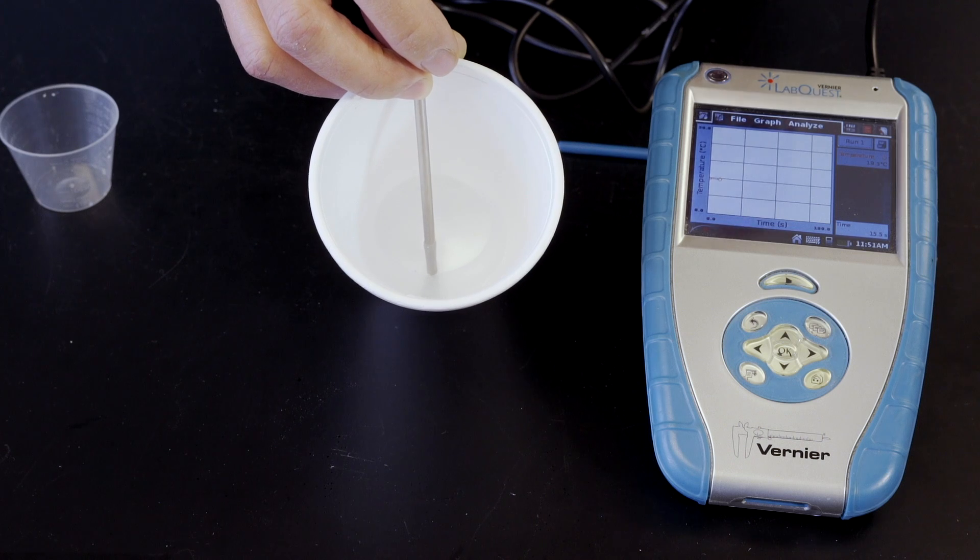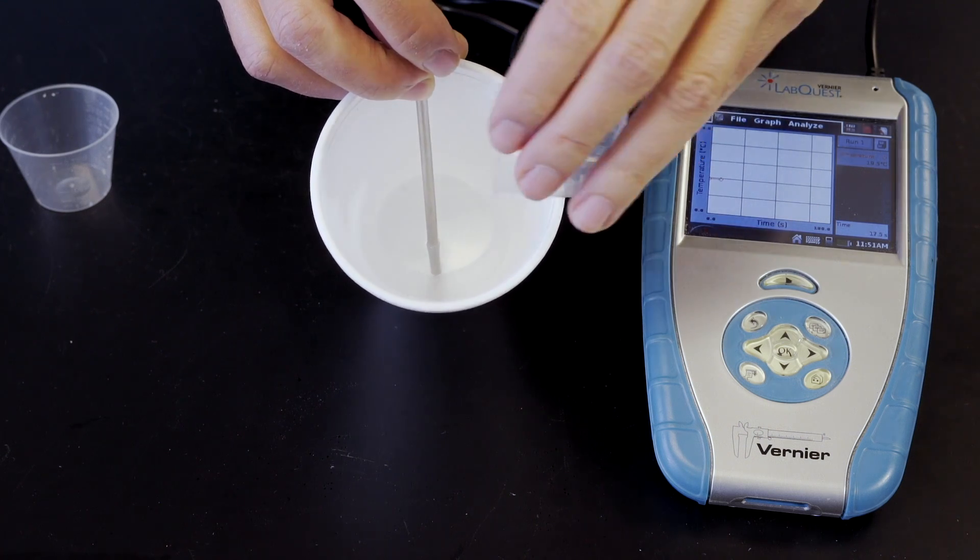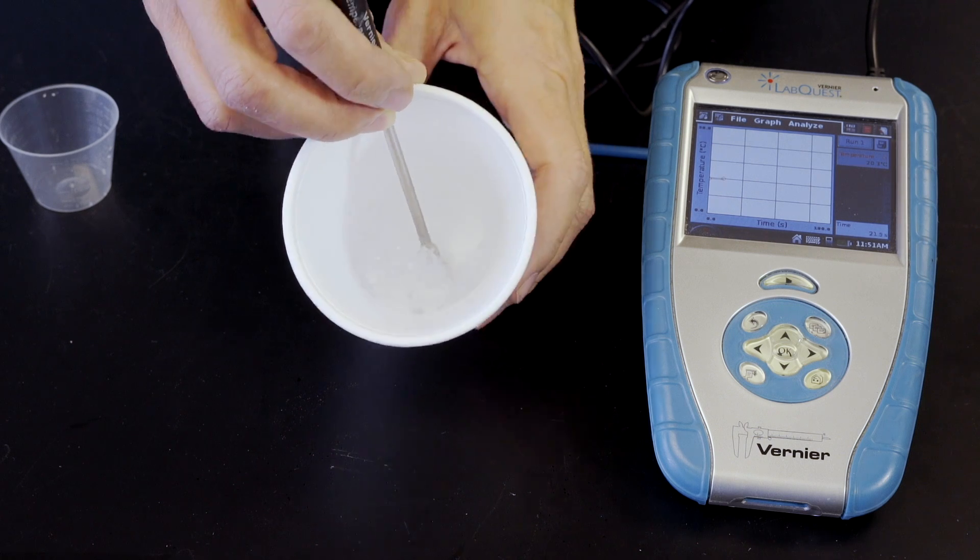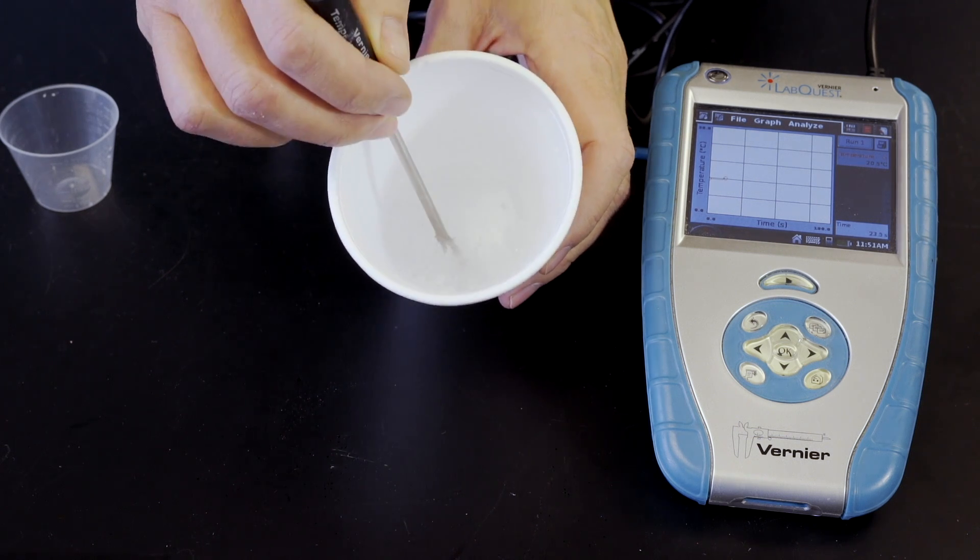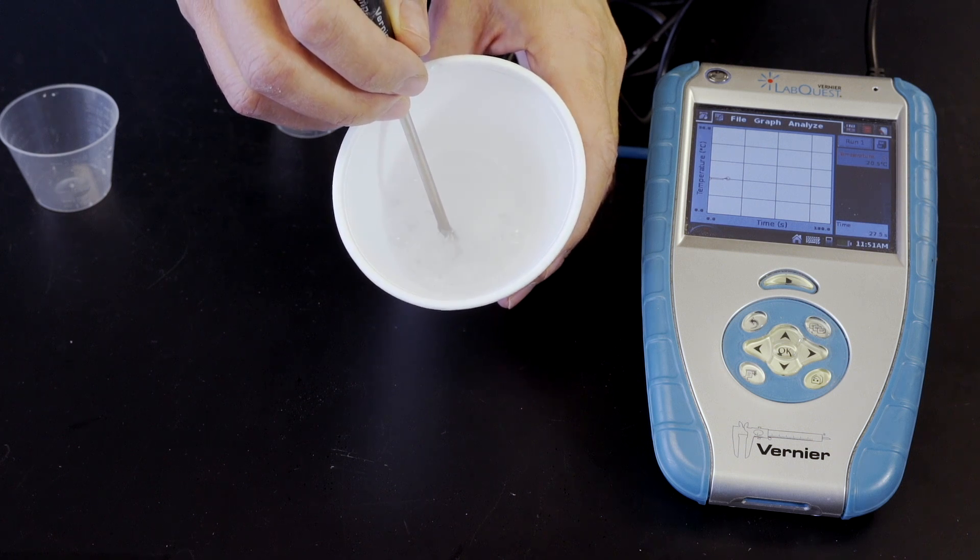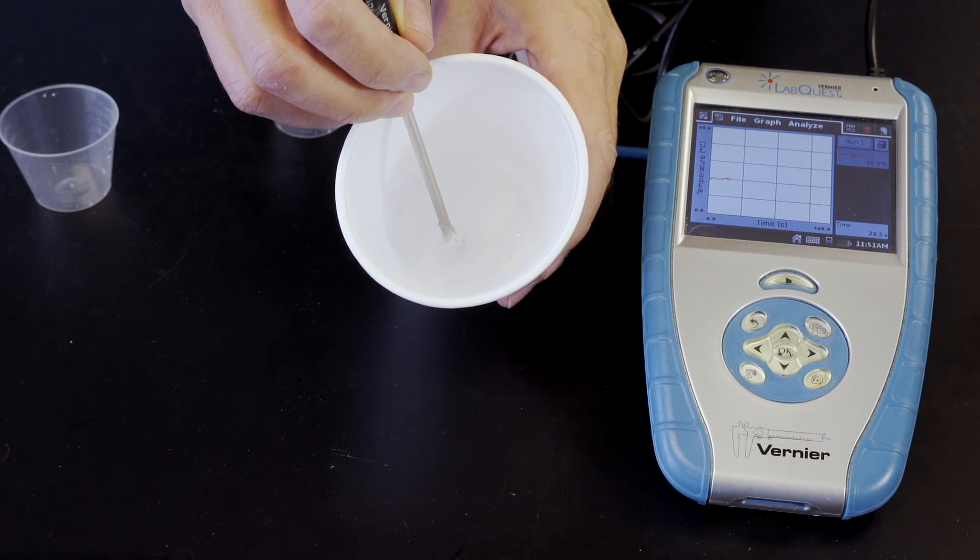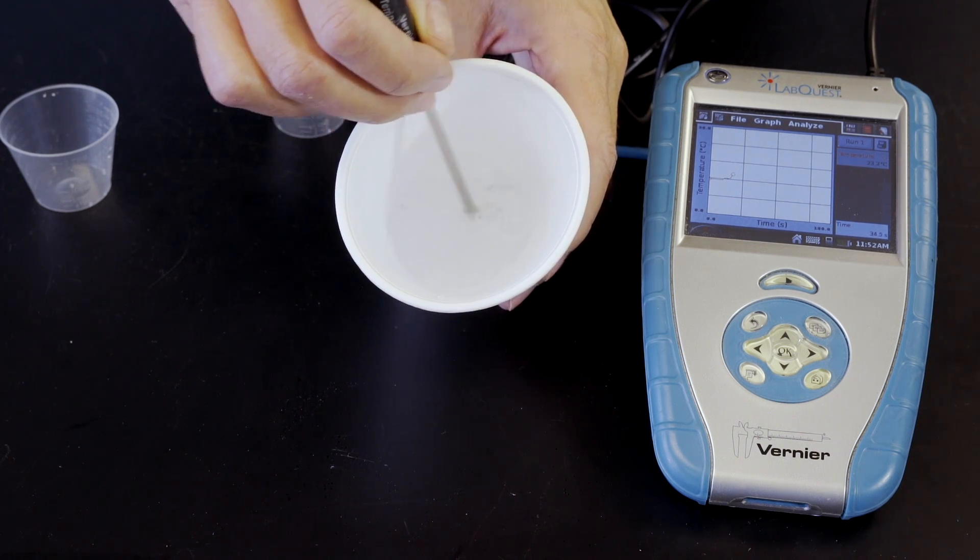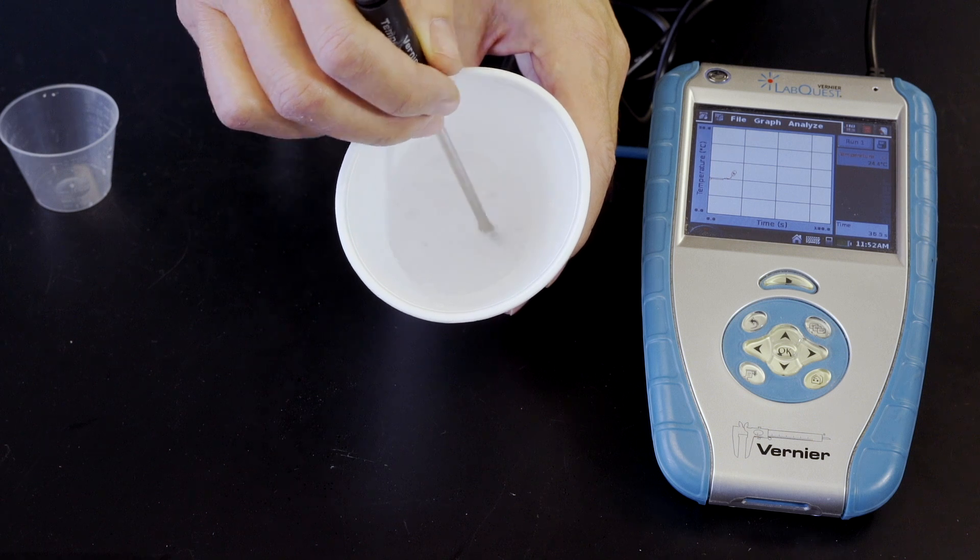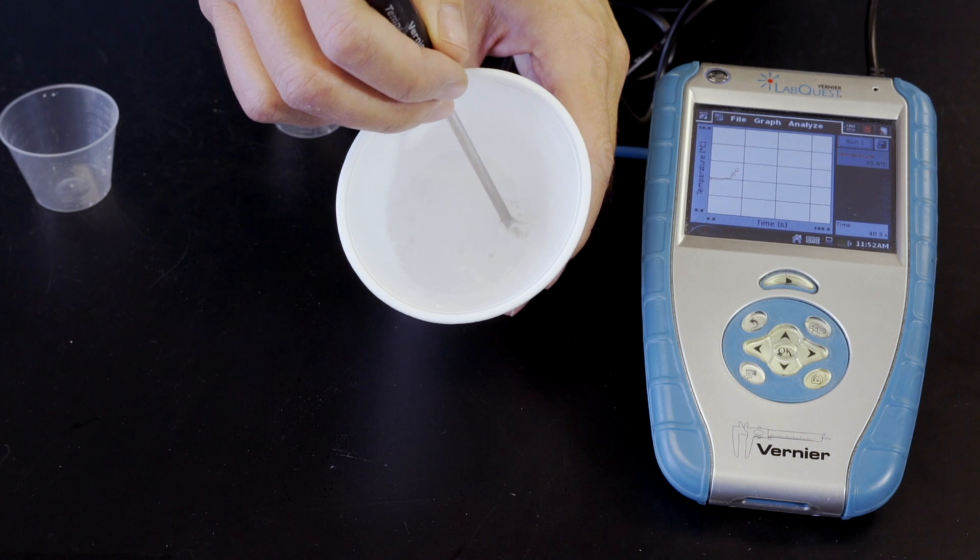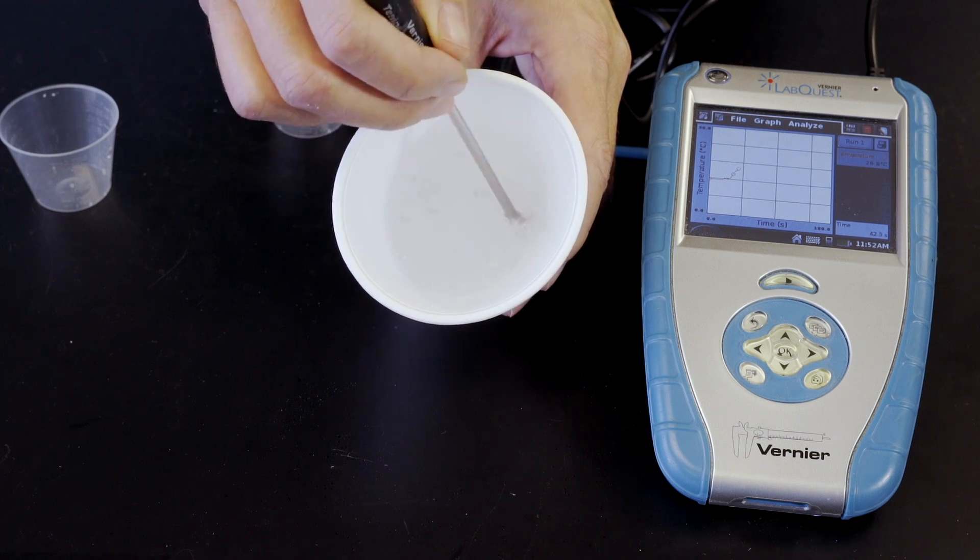Next, several nuggets of magnesium metal are added to the acid. Again, look for the four clues from the last lab that indicate a chemical reaction is taking place.